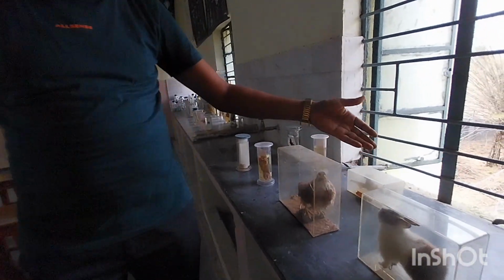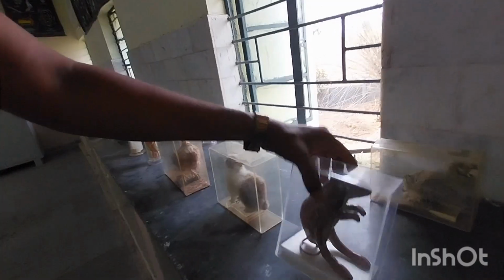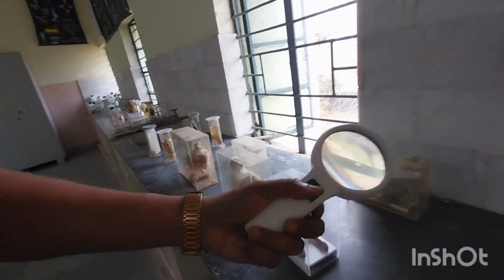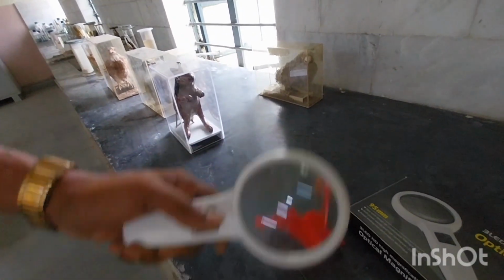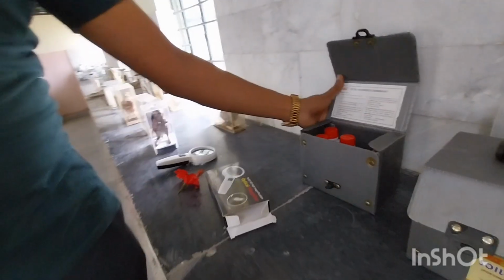Here the bat, this rabbit, kangaroo rat. This is the kangaroo rat, and this is the magnifying lens. Anything in large we can see by this. This is water testing kit to test the minerals in the water. How much quantity of minerals is present in the water, we can test by these different chemicals.